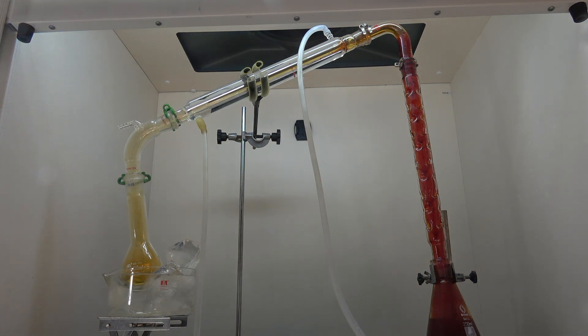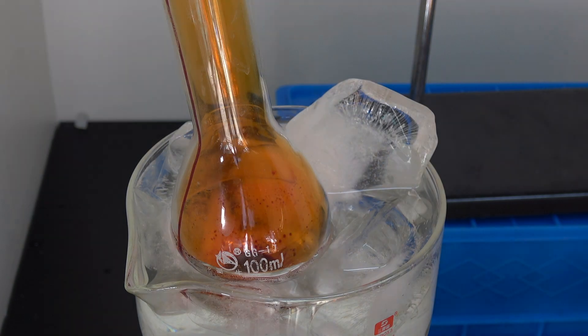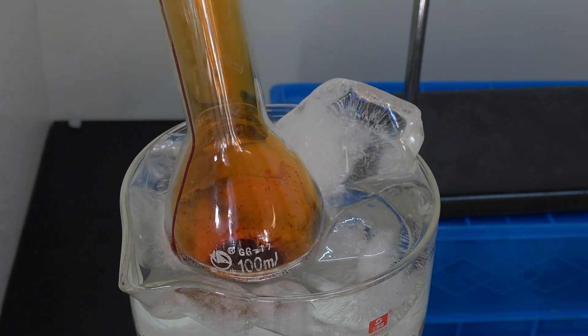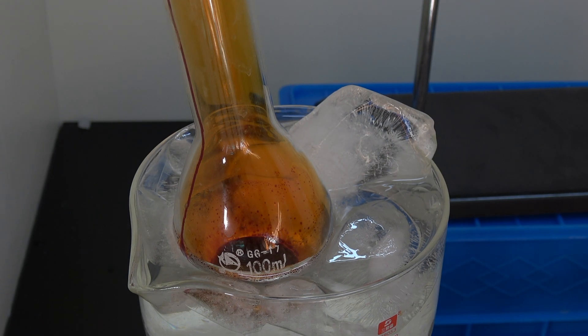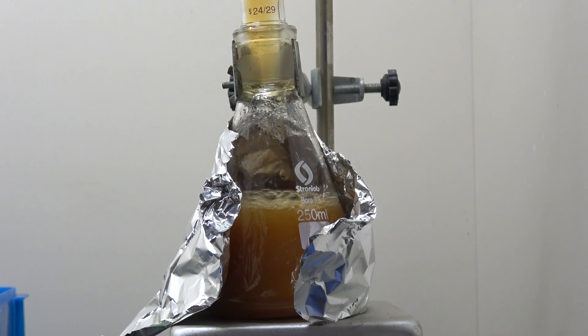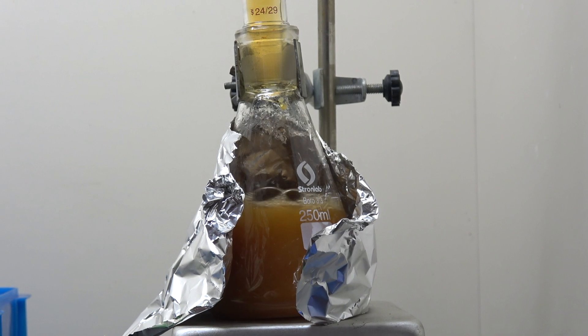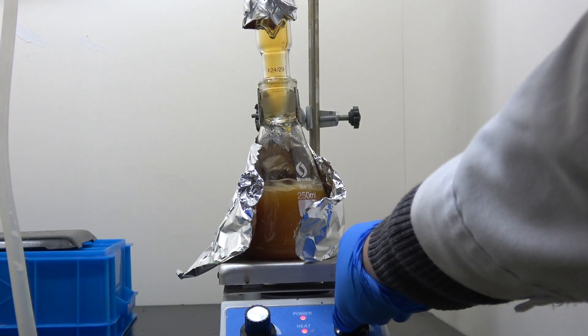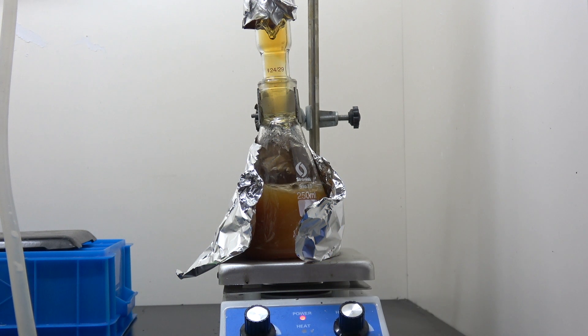It is important to turn up the heat slowly so no water makes it through the condenser. When no more bromine vapor is coming out of the distillation flask, I turn off the heat and let it cool.